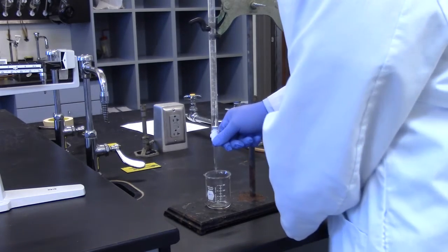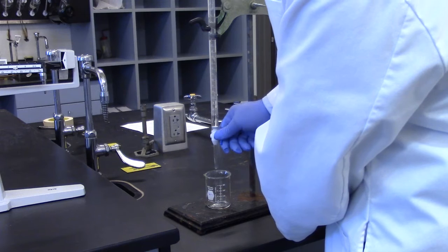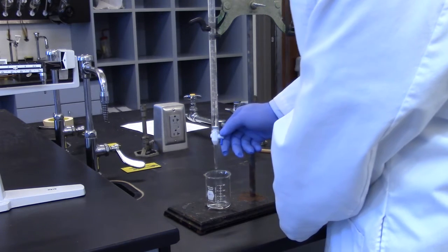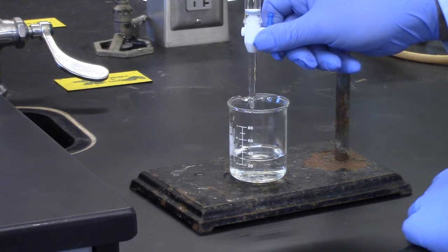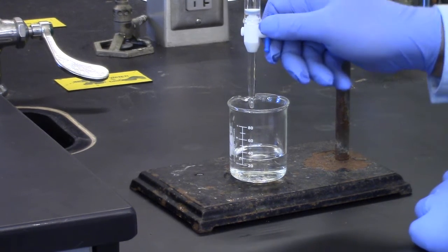Next, titrate in 10.0 milliliters of water directly into the 100 milliliter beaker. Practice using the stopcock by stopping at the 4.0 milliliter, 6.0 milliliter, and 8.0 milliliter marks on the burette so that you are confident that you can stop at the 10.0 milliliter mark.